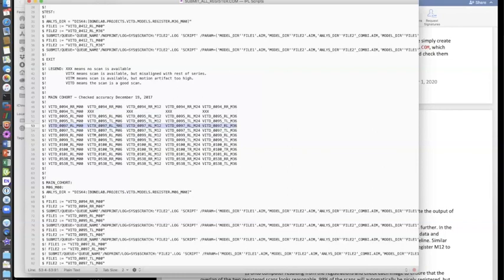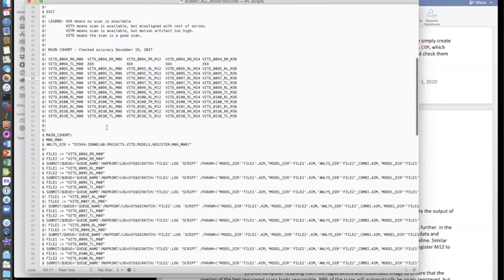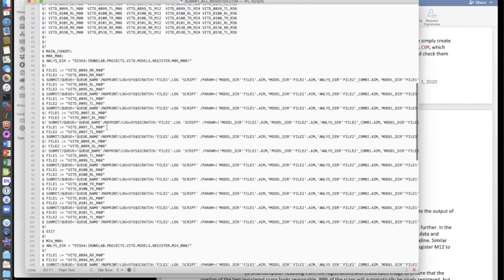If you exclude that one measurement, then in this case where we have 5 time points, we can still do a longitudinal analysis on the remaining 4 and get excellent results. So if you can discover which image is not working, then you can exclude it. So I said I often check.